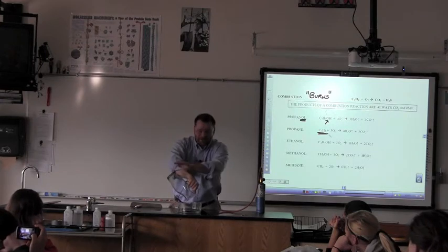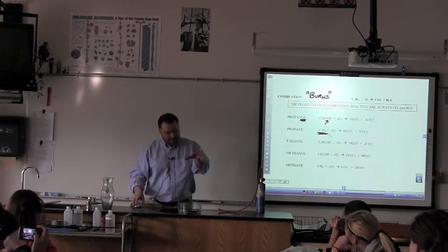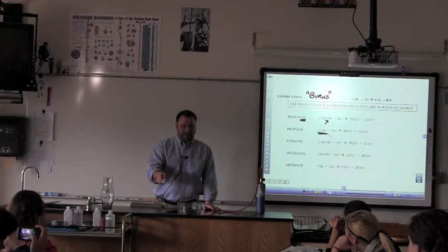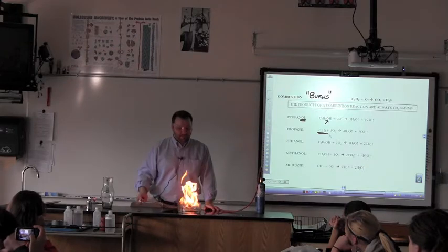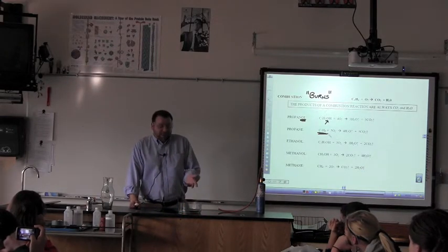Got to get all of it out, you know. Okay. Because it's more dense than air, it's going to sink down into the lowest space that it can contain. And there we go. So because of its density, it actually does this. Which you think, pretty cool, right?